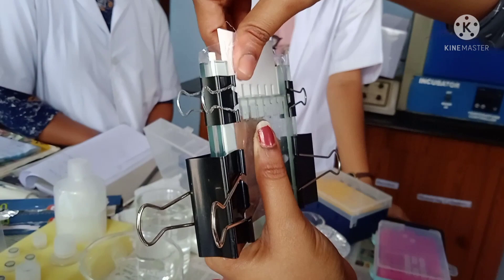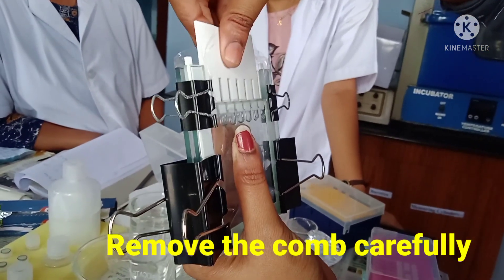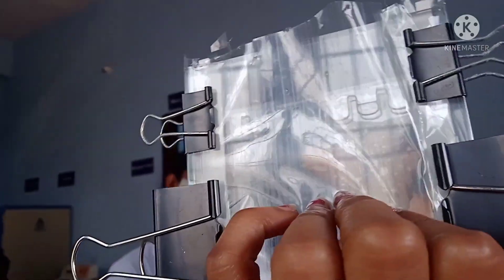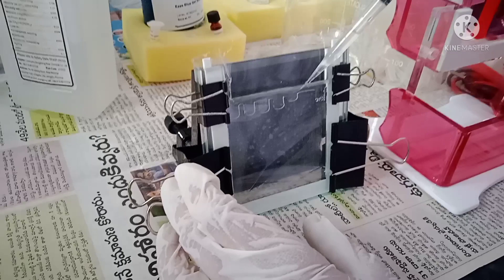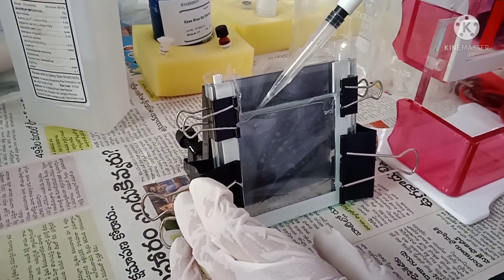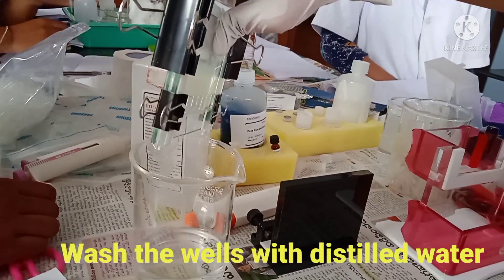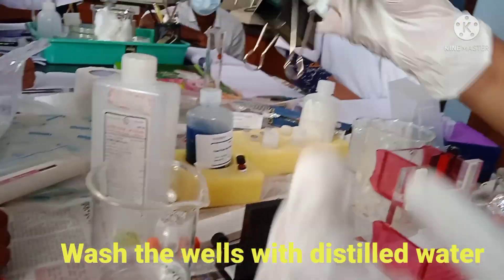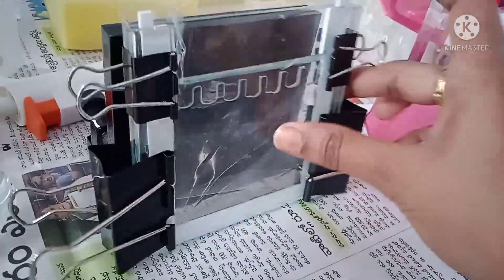Check whether the gel has solidified by inverting the gel cassette. If solidified, carefully remove the comb without disturbing the wells — you can observe the wells clearly. After removing the comb, clean the wells with distilled water, then revert the cassette to discard the water. The wells should now appear clear and ready for sample loading.